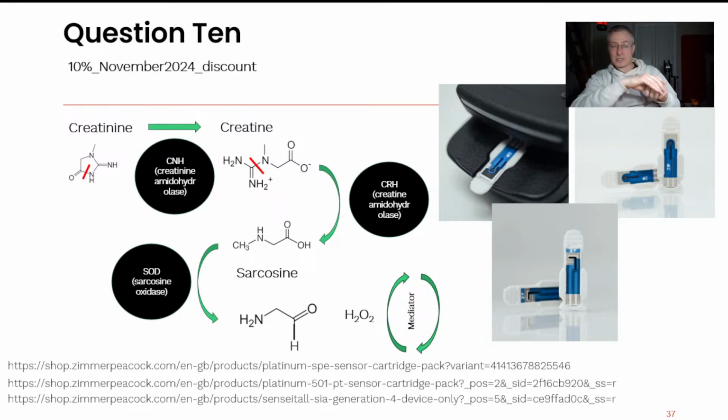You can detect creatinine. Just look at our caffeine work in a few slides above, where you can actually see that we essentially had a sample without any caffeine in it, then we added caffeine and you saw the signal go up. You can do that kind of experiment with creatinine as well, and you will probably detect it. And you can probably do that on a carbon electrode without much modification, or any modification, actually. And that's super simple. But sometimes you'll be judged that, oh, you made it too simple. And that's the problem, but okay.